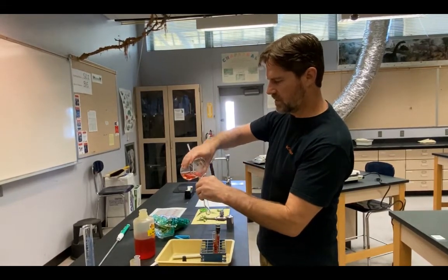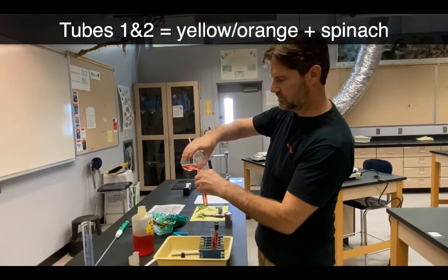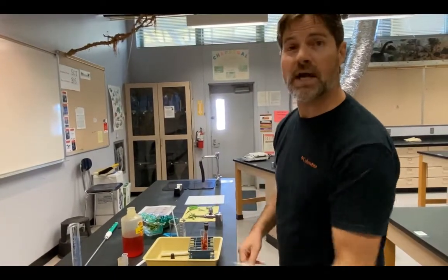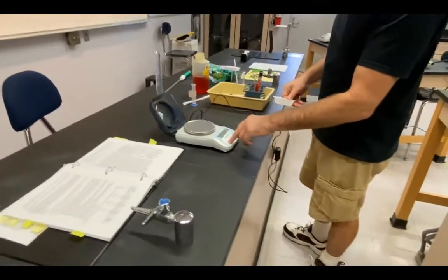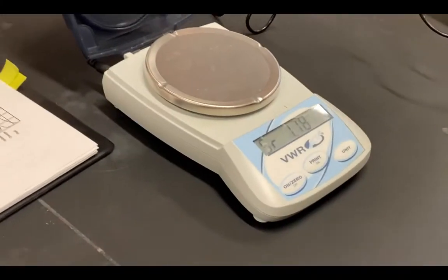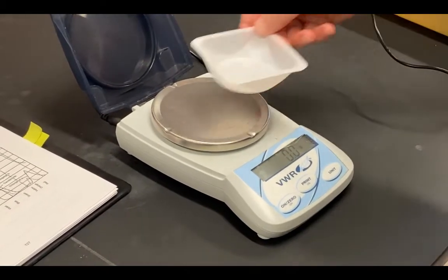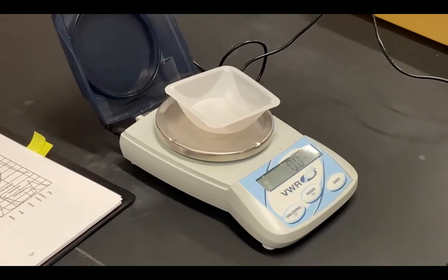I need to add spinach to both of these. And of course, in the interest of controlling this experiment, I want to make sure that these are going to have the same amount of spinach. So I'm going to go ahead and weigh that. I will turn on my scale. I will add my weighing dish. I will zero my scale.